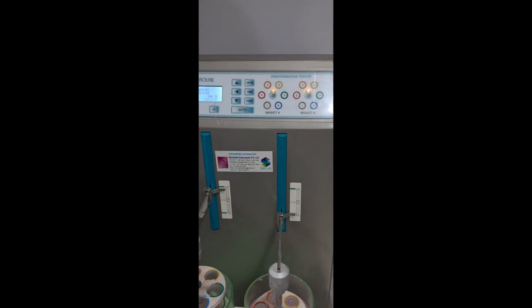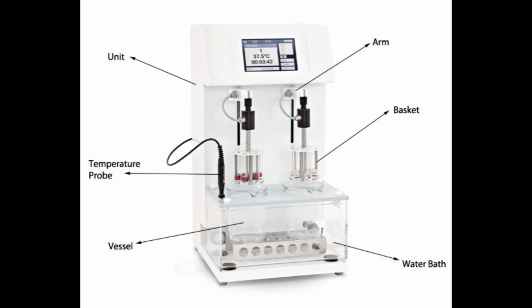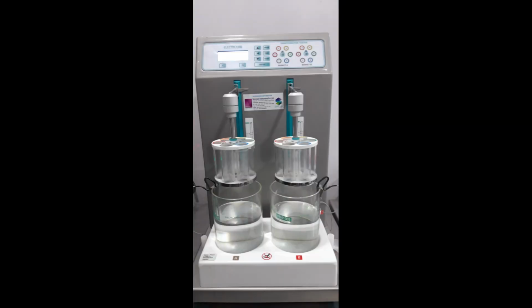Mid-20th century. The European, EP, and British, BP, pharmacopoeias harmonized around similar methods, cementing the basket rack as the global standard. Technological refinements, 1970s-2000s. Automated timers and counters, mechanical counters replaced manual stroke counts. Digital temperature and stroke control. Microprocessor-based units maintain 37 plus or minus 2 degrees Celsius and 30 plus or minus 2 CPM precisely.